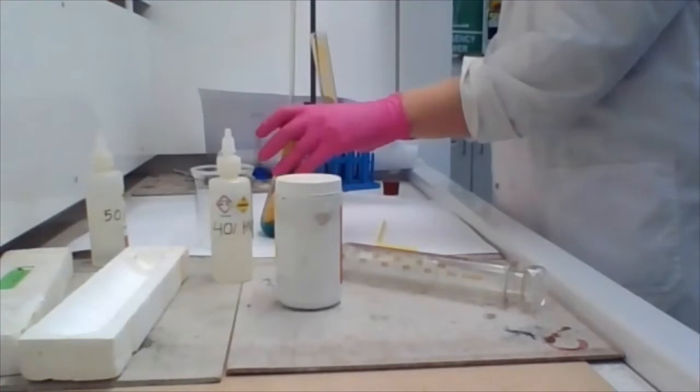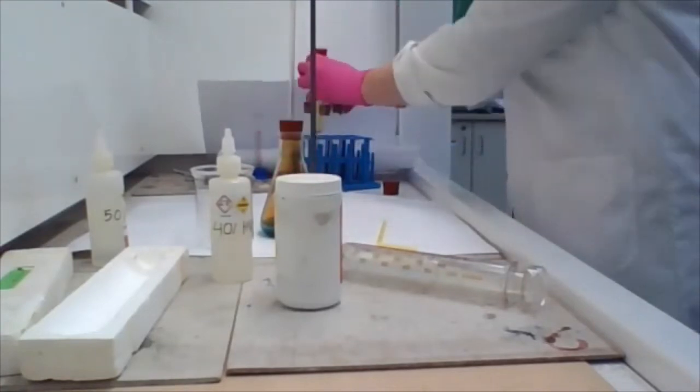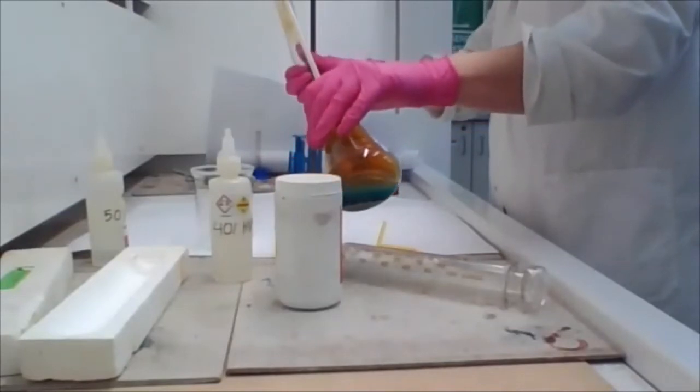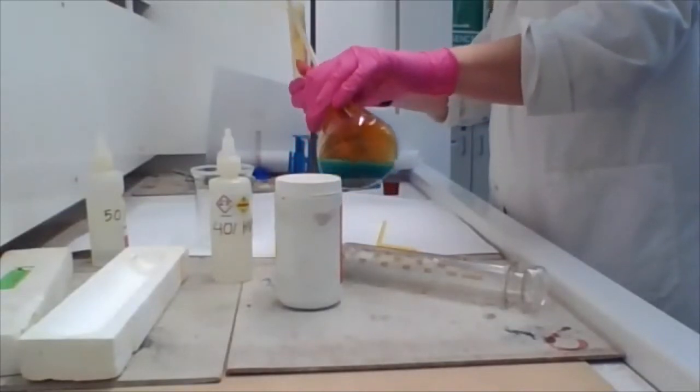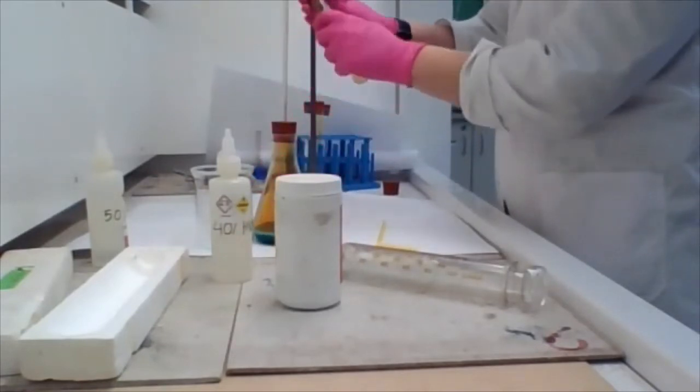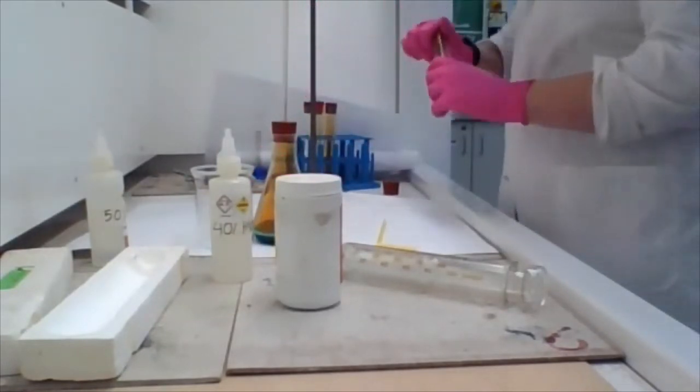Now, NO2 is heavier than air, so I'm in a fume cupboard, but I'm able to just sort of pour the gas in, and you can see that brownish gas filling up that test tube fairly quickly. This isn't sped up at all.